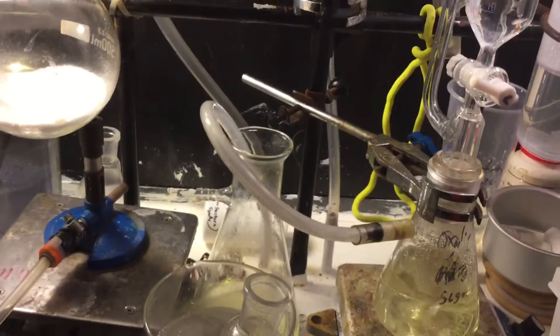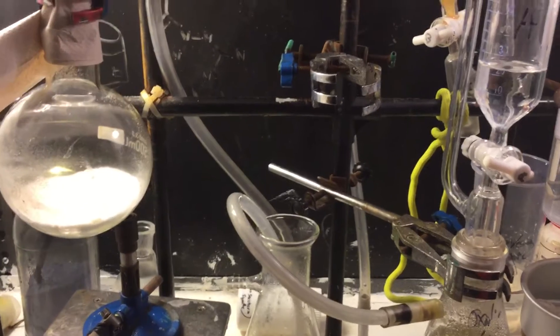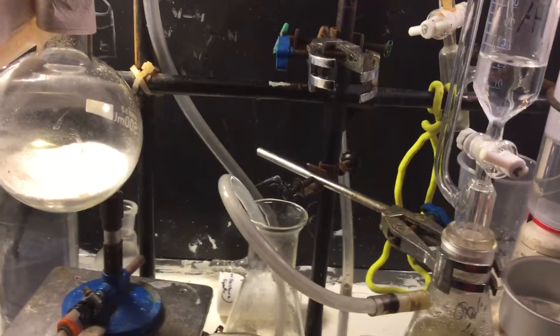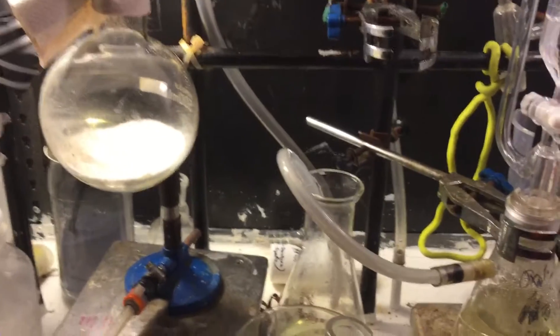Okay, so just a little project update. I was trying to make some sulfur trioxide and chlorosulfuric acid for saccharin and also sulfanilamide synthesis, why not?